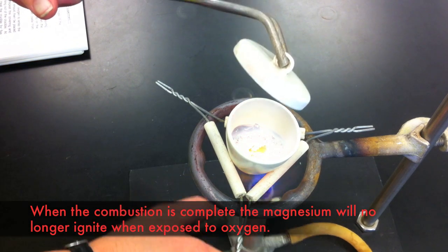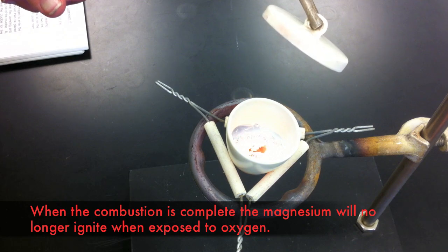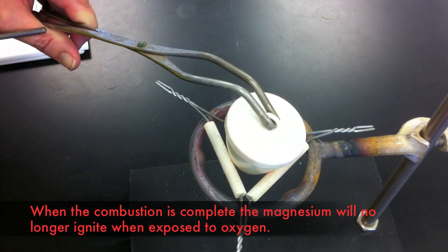You can turn off the Bunsen burner and leave the crucible to cool. Allow it to cool completely before proceeding with the next step.